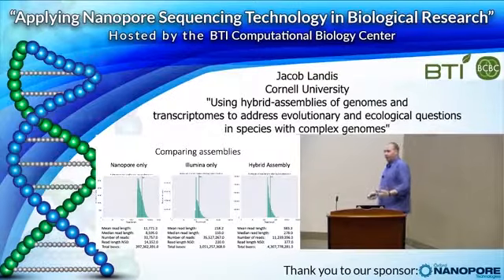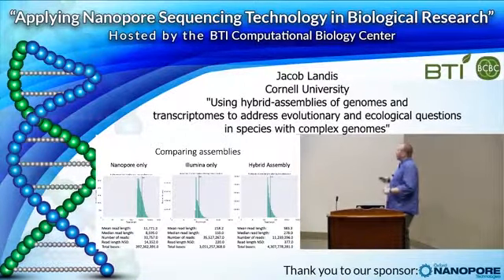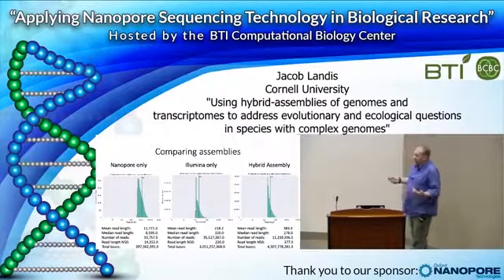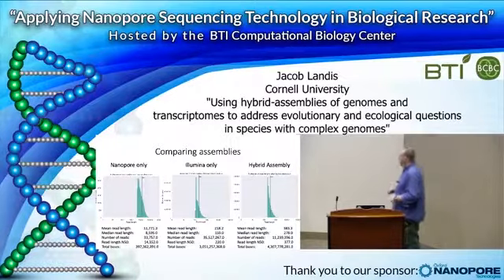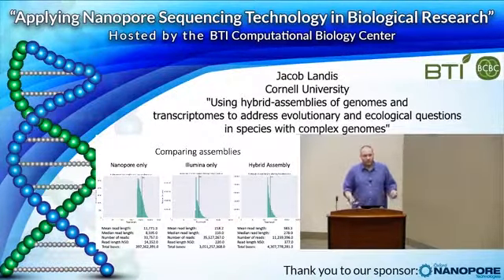You use the Nanopore data to scaffold, so even though those didn't do very well in just the assembly by themselves, you add that to the scaffold. We do cut down our number of reads quite a bit. We still have a ton, but we are now assembling 4.3 out of the 5.5 gigabases. So we don't have a complete assembly for sure, but we're making progress.